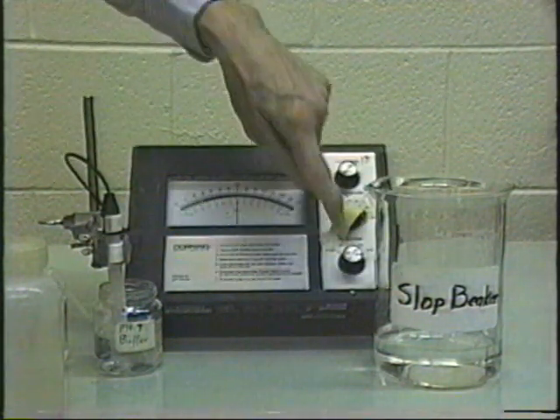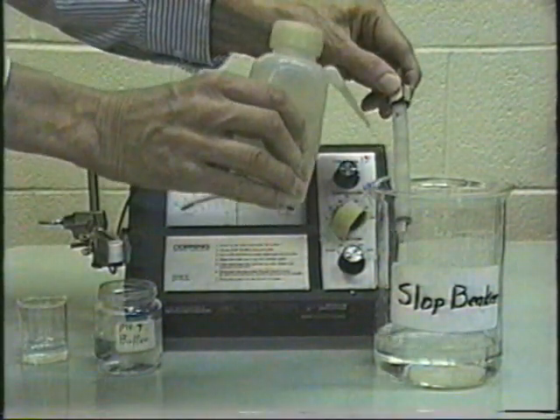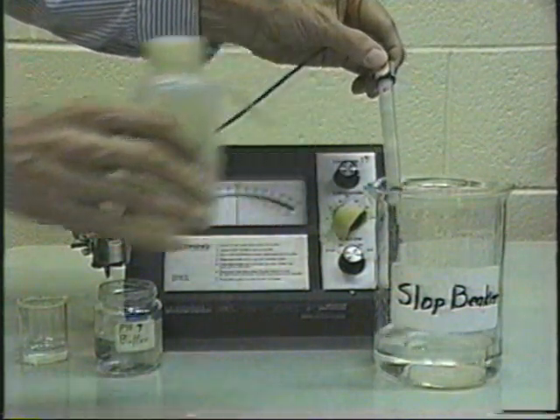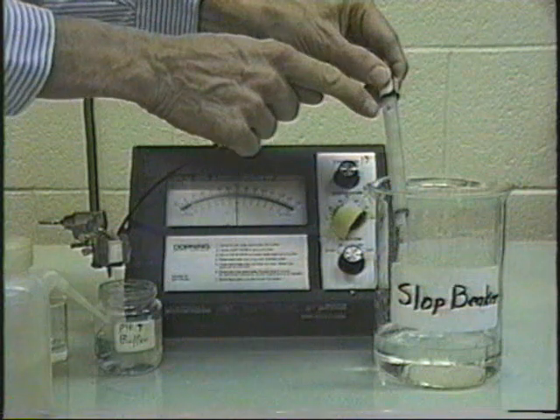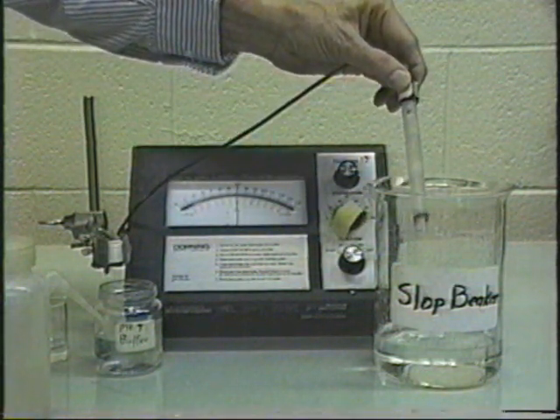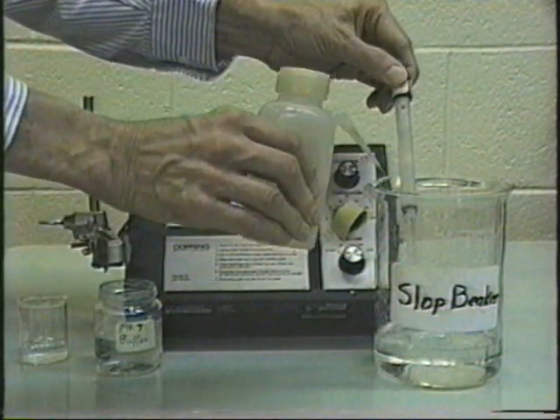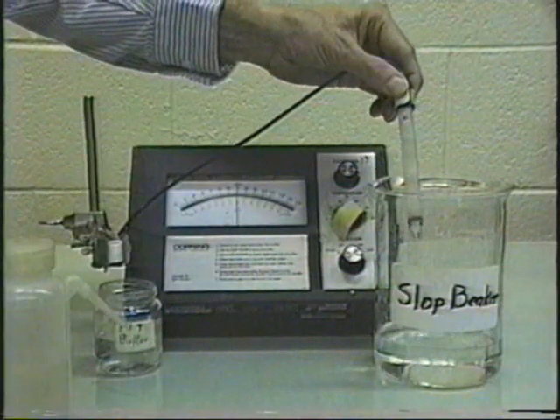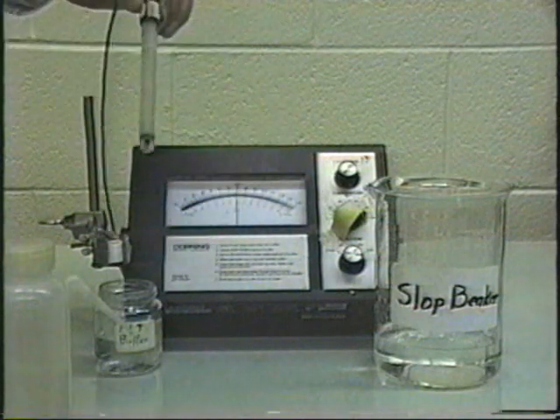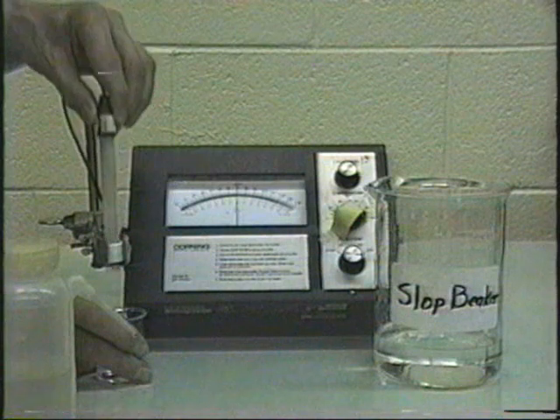To do that, we put this on standby, wash off our electrode. When you handle the electrode, be very careful that you don't tip it. As you can see, there's a hole here which allows filling of the reference electrode with saturated potassium chloride solution. So you must not tip it because the solution will run out. But anyhow, you wash off the electrode, pat them dry with a clean paper towel, and then you're ready to make your measurement of the solution that you brought here.